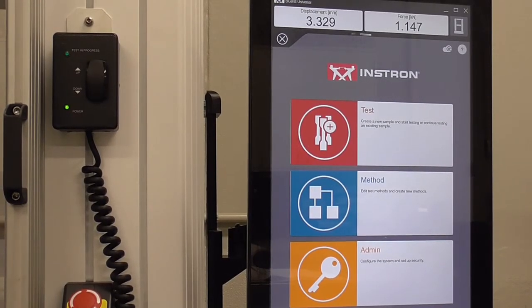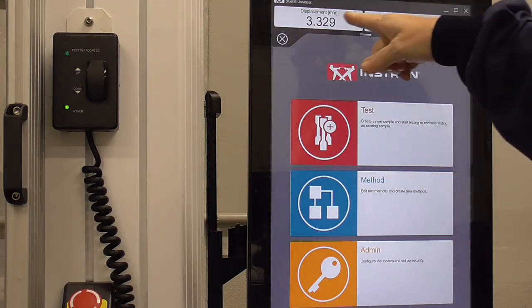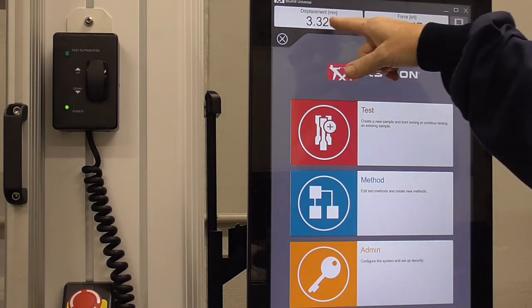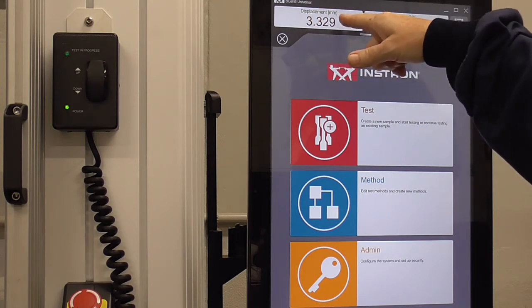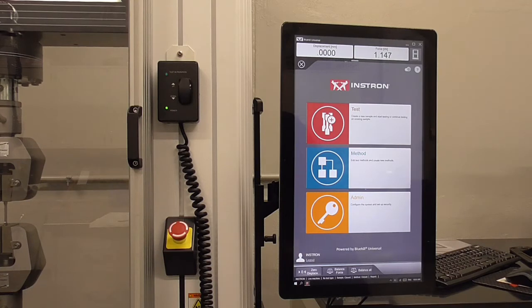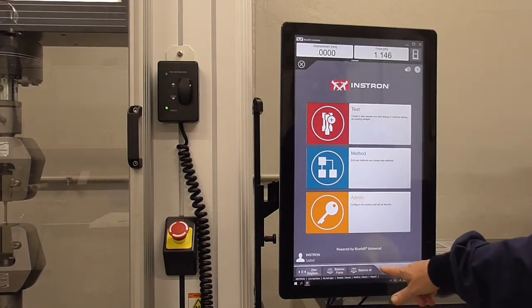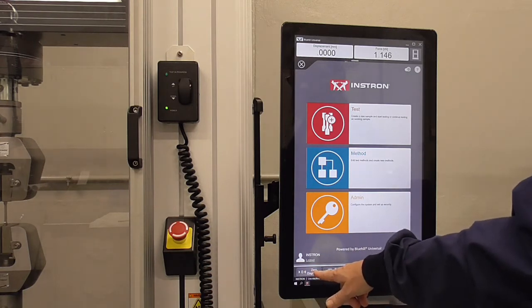Now that the dog bone is in, you'll notice a little force on the load cell — about one kilonewton — and that's fine. That force comes from putting it in the grips. Since I had to jog a little to get it in place, we do want to zero the displacement, which you can do in the lower toolbar.